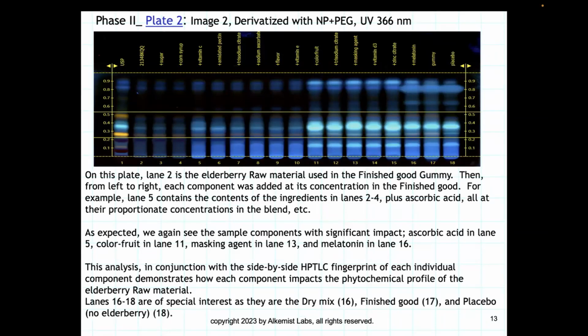And what you'll see is, if I can get my cursor, okay, what you see is some semblance or resemblance or carryover from the powdered extract. And in these images, what I was getting at before is that it might seem the best when we look at it in VisionCATS, and then every time we, I guess in a sense, copy it or move it to a different digital format, it loses something.